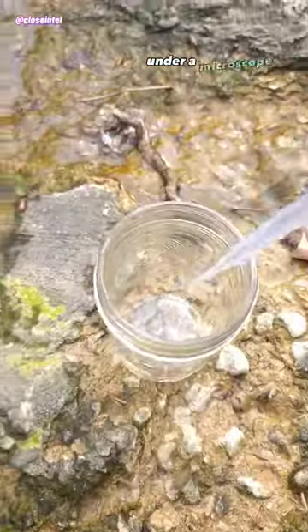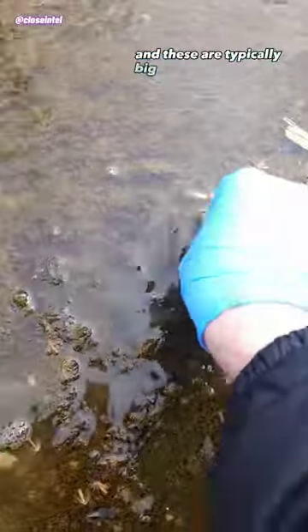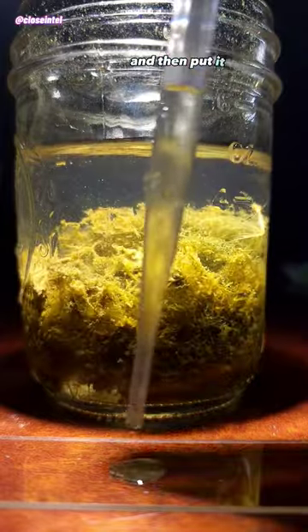Today I'm going to show you some creek water under a microscope. I got a ton of the algae that was sitting at the bottom, and these are typically big colonies of diatoms. I got a few different samples of the debris from the bottom of the jar and then put it on a slide.